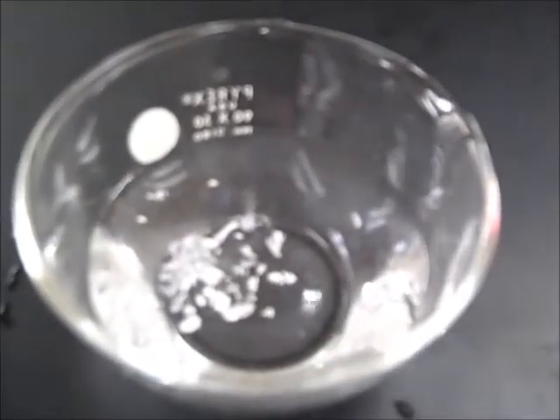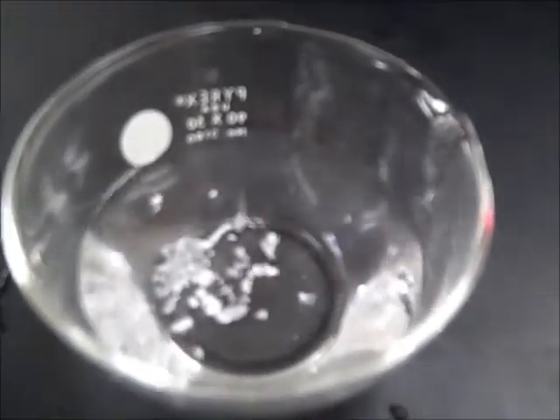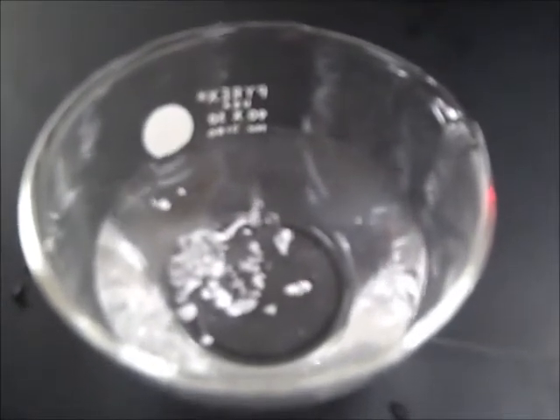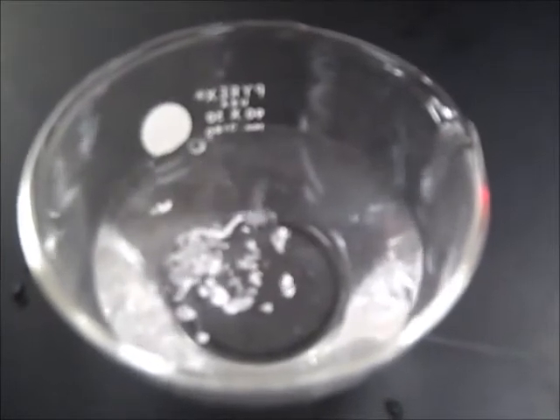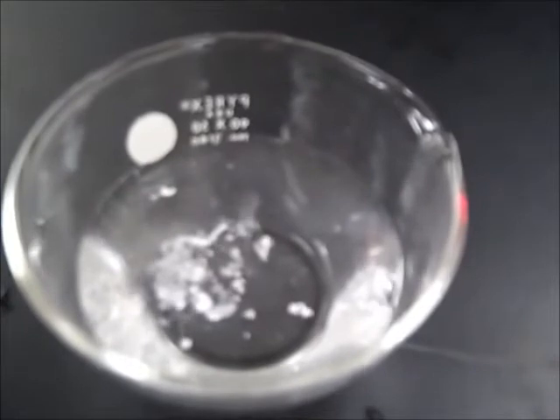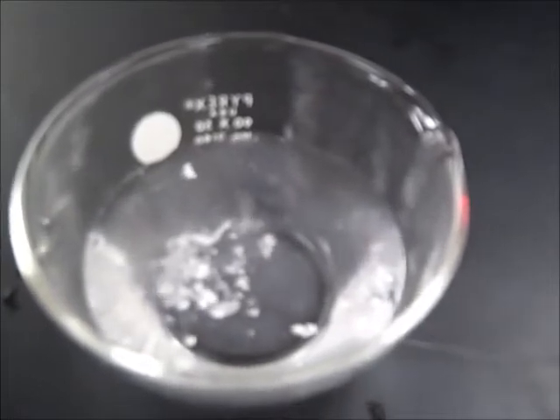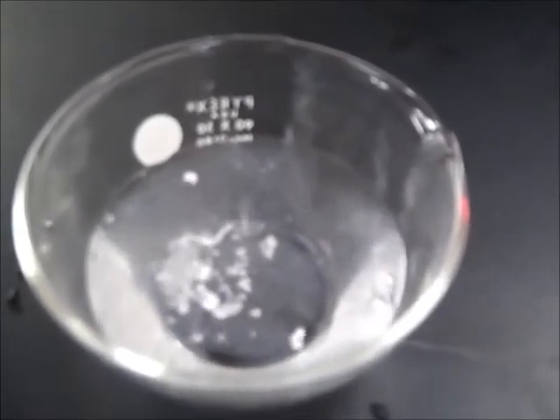Hopefully we are starting to see something. I don't know if the camera can see it. What do you see coming up, Nick, so far? A little bit of bubbles. Some bubbles, definitely a sign of chemical reaction. It's taken a little while, but definitely we are seeing calcium react with water. The water is becoming cloudy.